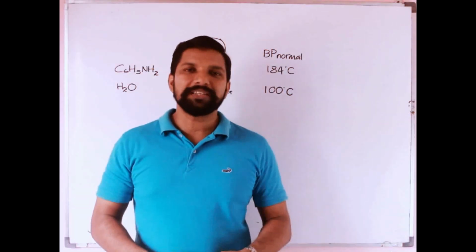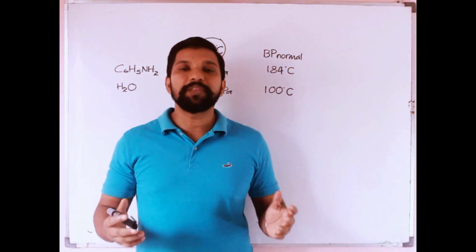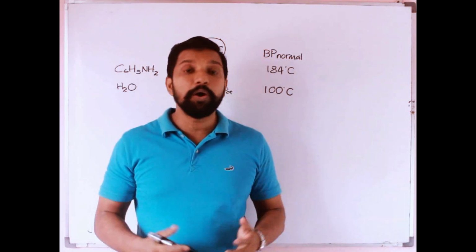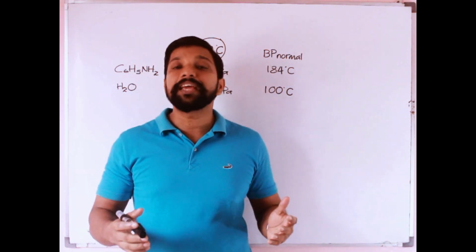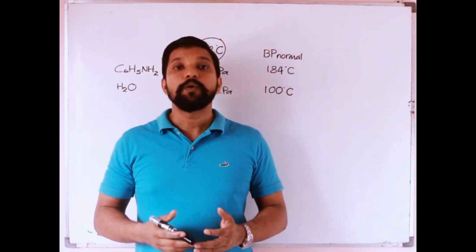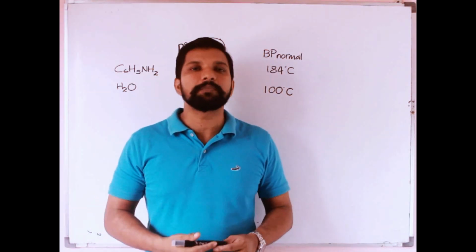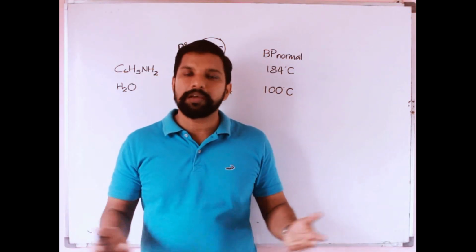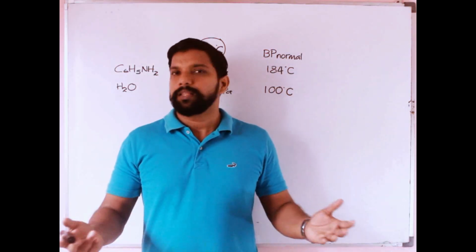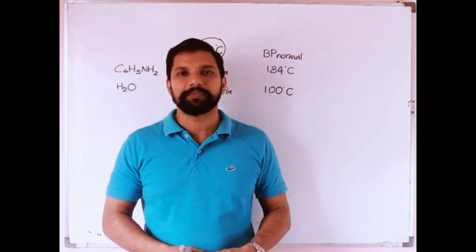What are the uses or the advantages of doing steam distillation? Most of the liquids that we extract in steam distillation have higher boiling points than water. Not only do they have high boiling points, they are thermally sensitive, which means if you heat these liquids to their boiling points, most of the time they will undergo some other reactions. They can get oxidized, they can undergo cracking, or even they can get combusted.